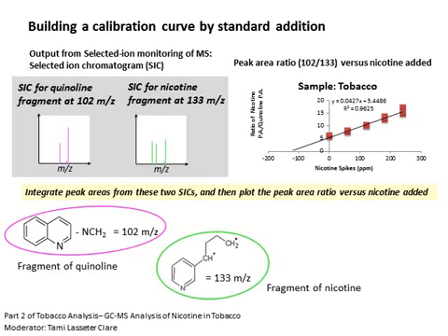The written procedure has already provided standard nicotine solutions at concentrations that are appropriate for these samples. Typically, we're aiming for each spike to give a signal that is 25% larger than the previous concentration signal. You should have at least 3 spikes to your sample. Using standard addition, you extrapolate back to the x-axis to figure out the concentration of your unknown.